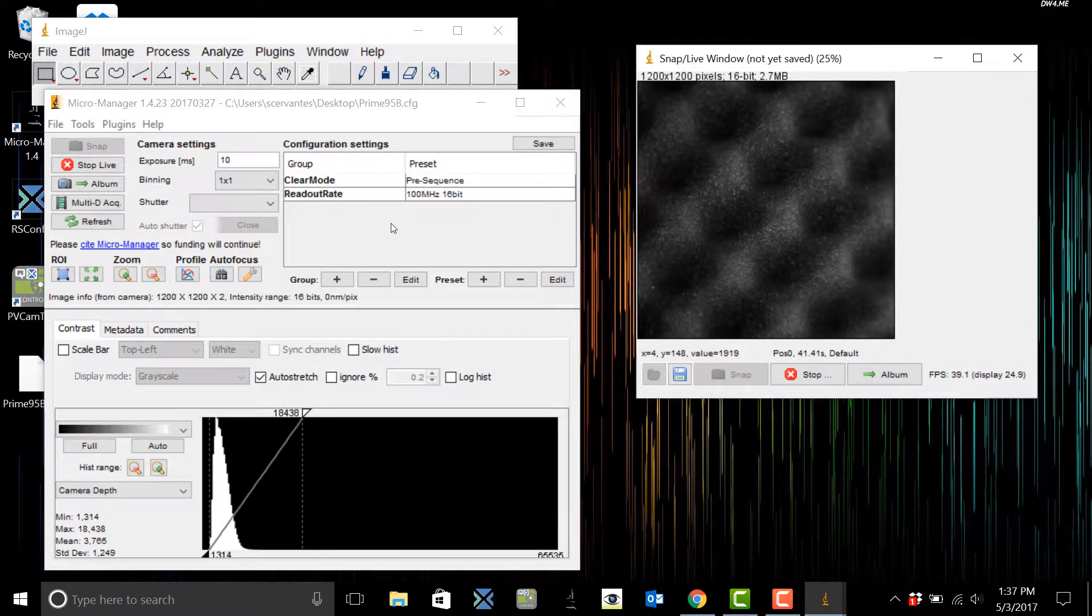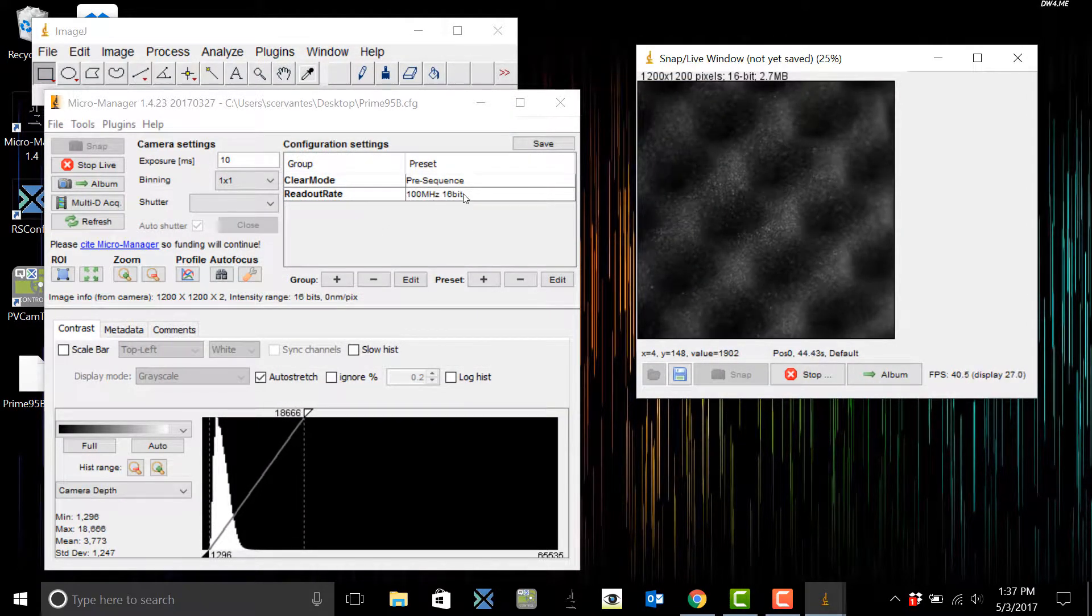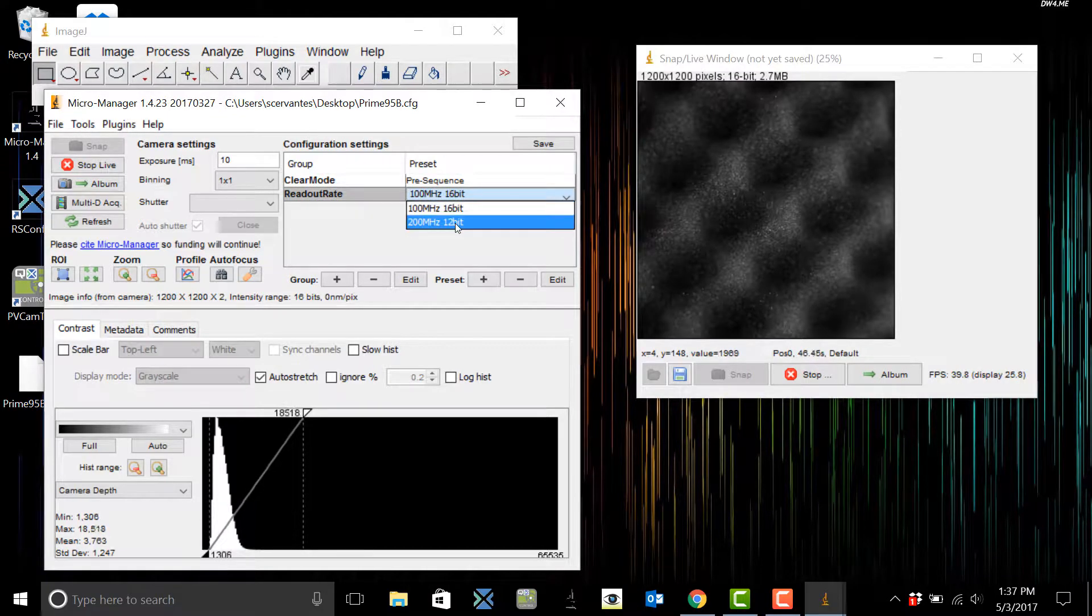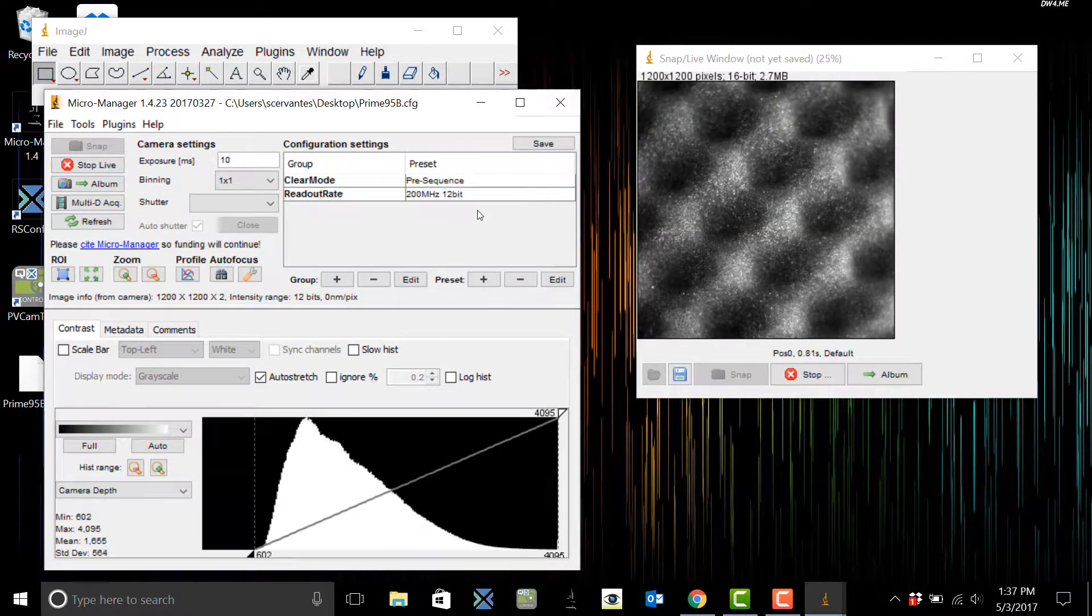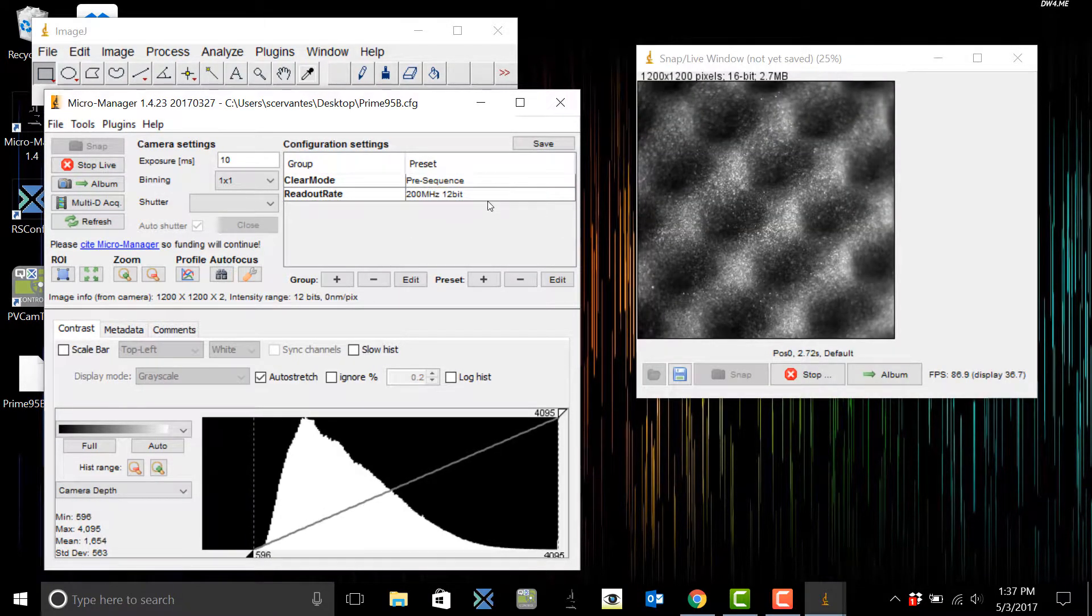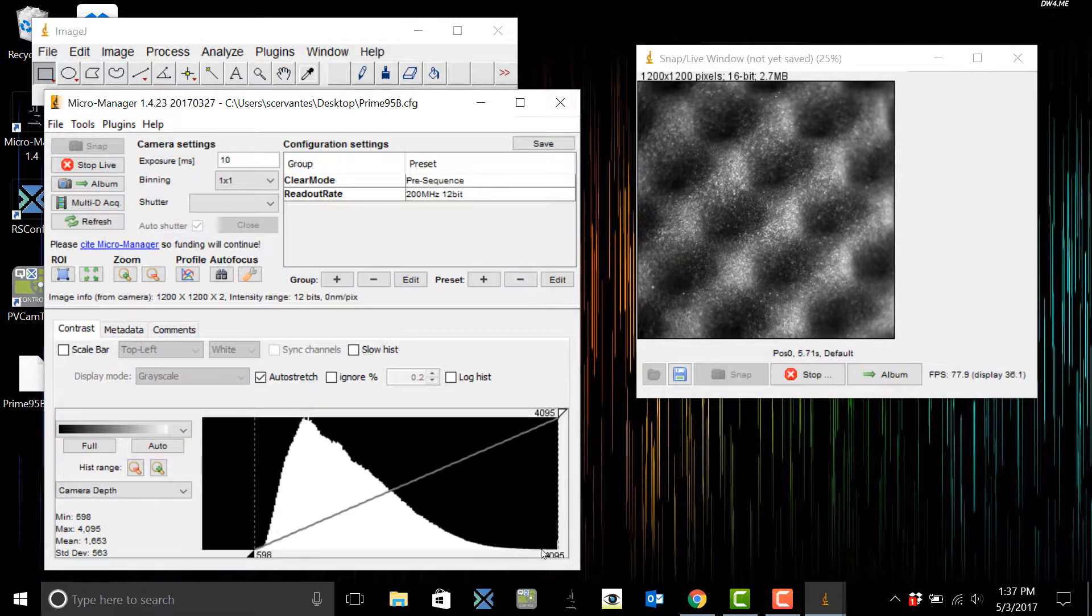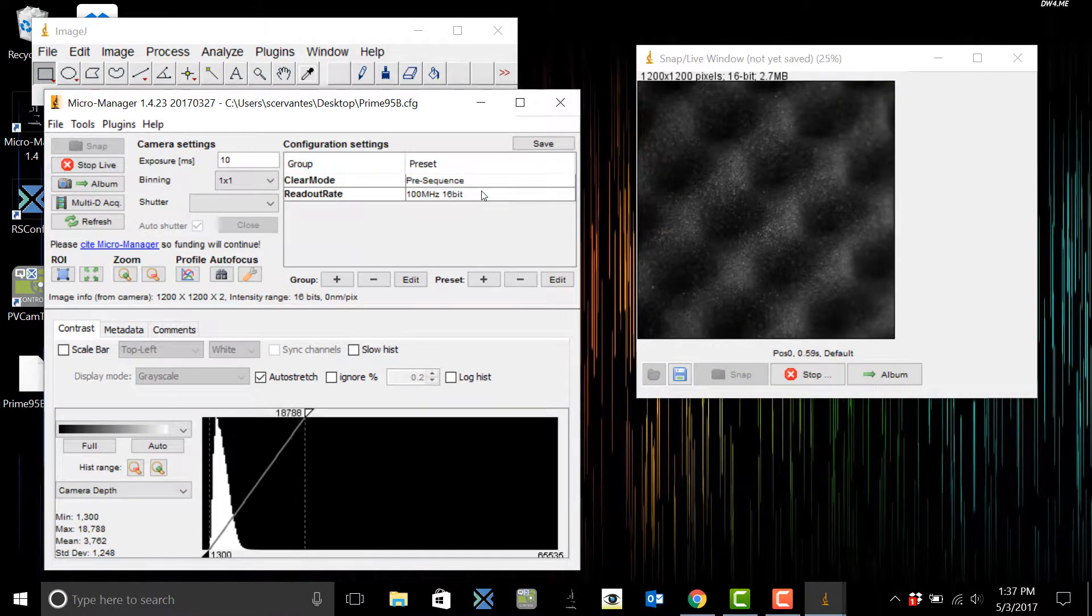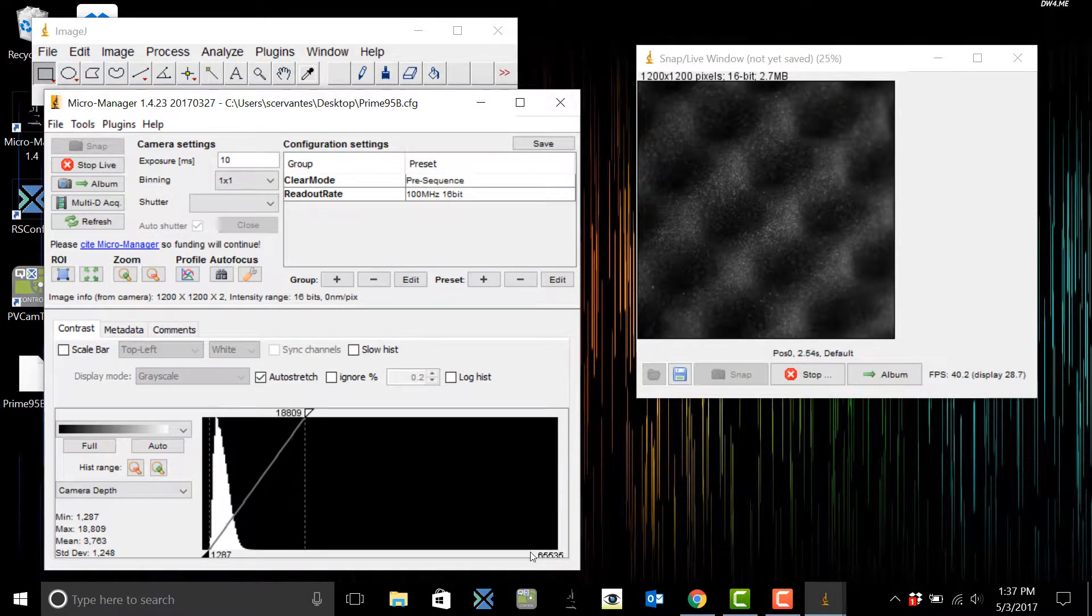But you also have the option of a 200 megahertz with a 12-bit mode. Now with the 12-bit mode that's going to give you the highest frame rate up to 82 frames per second. With the 16-bit mode you are going to have the best full well capacity and noise performance but the frame rate is a little lower at 41.